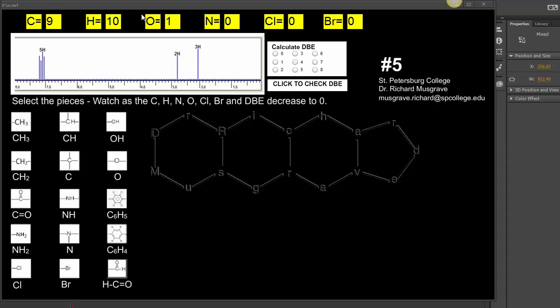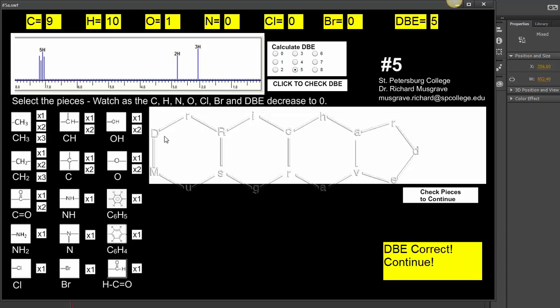This compound is C9H10O with five double bond equivalents. Looking at the pieces, we have a 5H in the aromatic region between 7 and 8, which would be C6H5. We've got a 2H and a 3H.